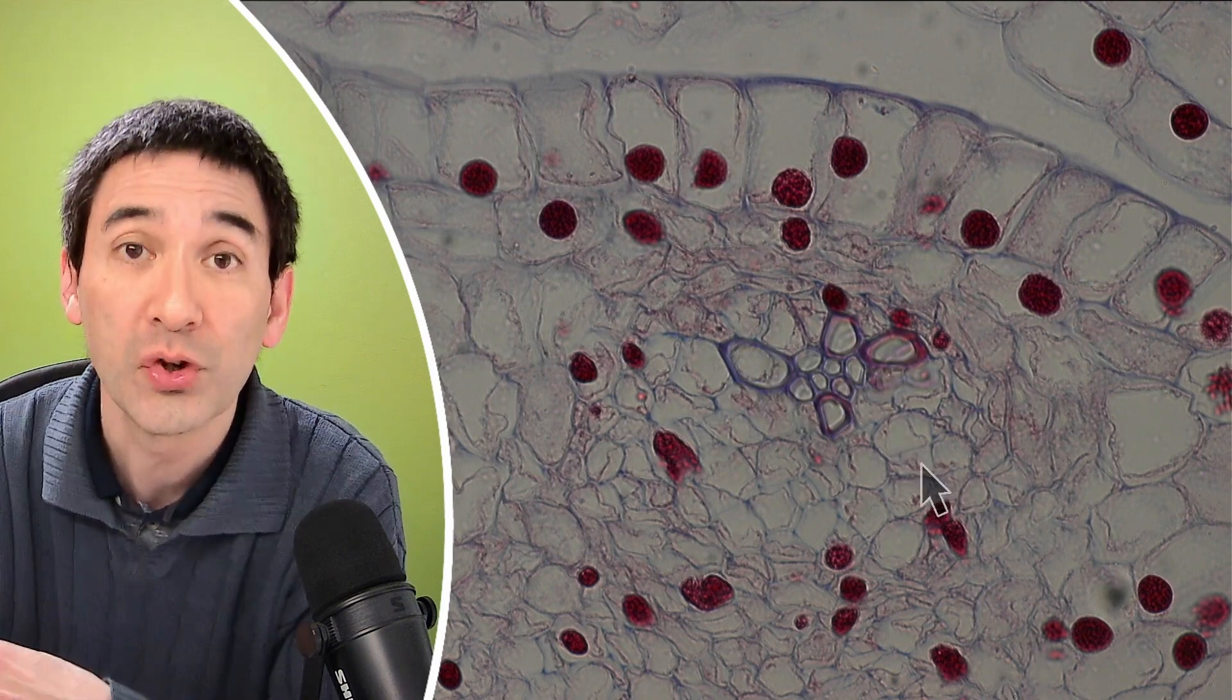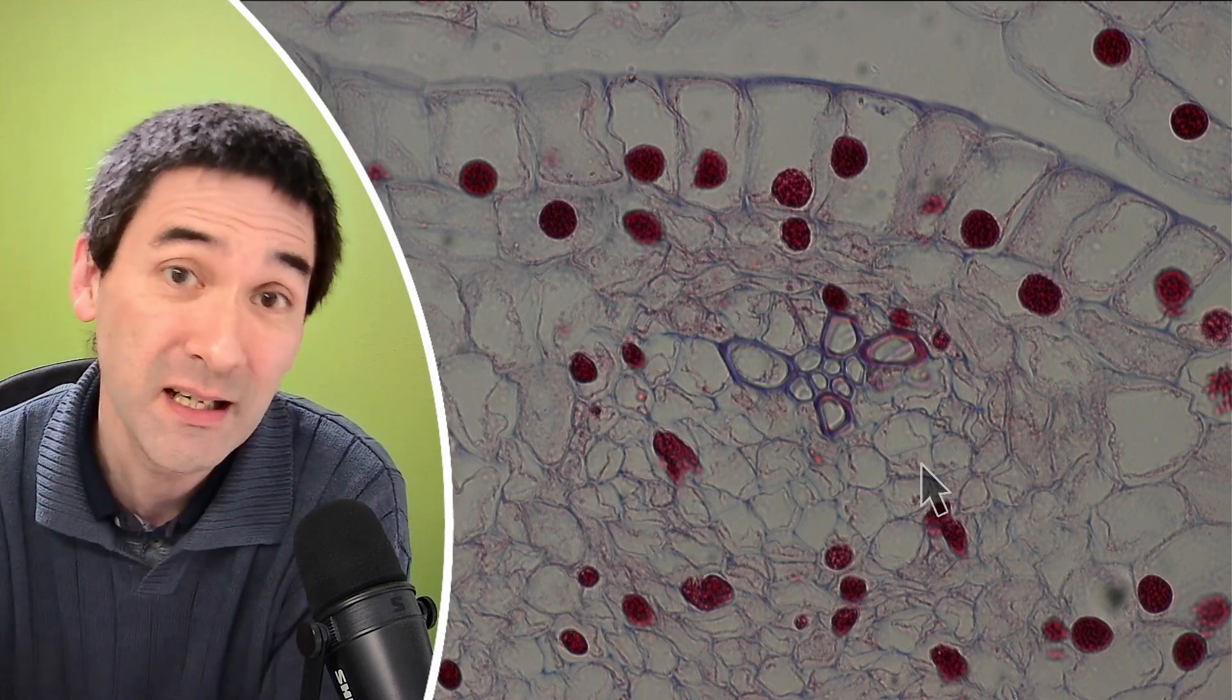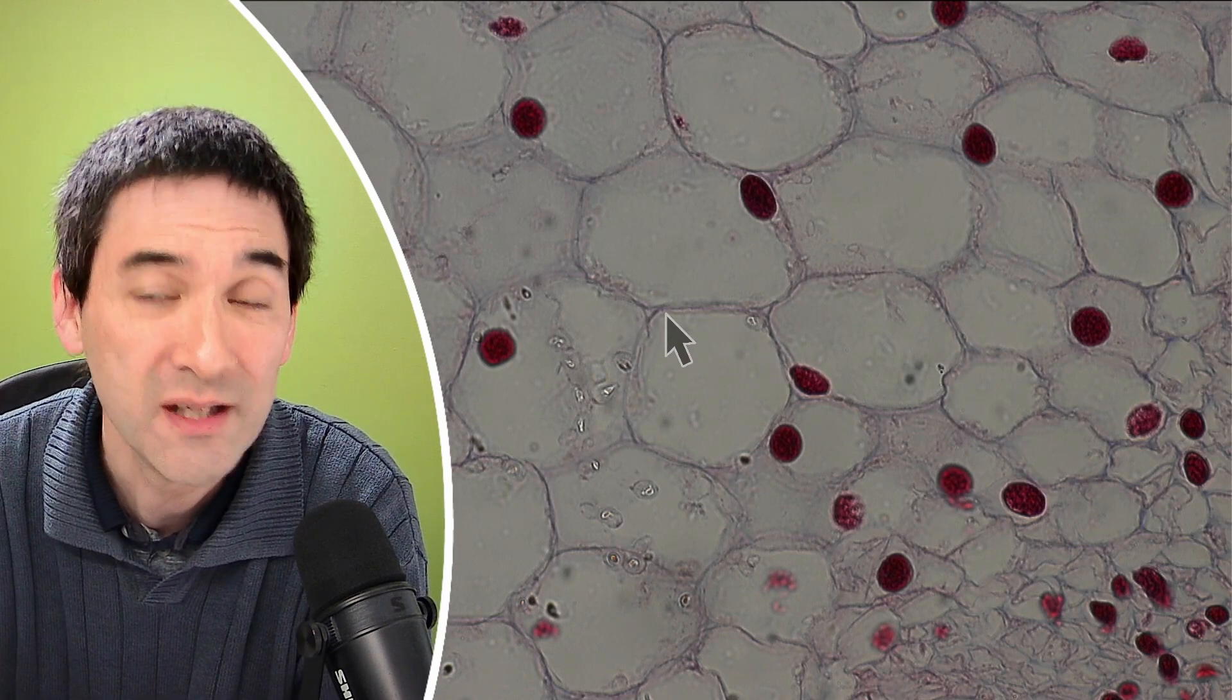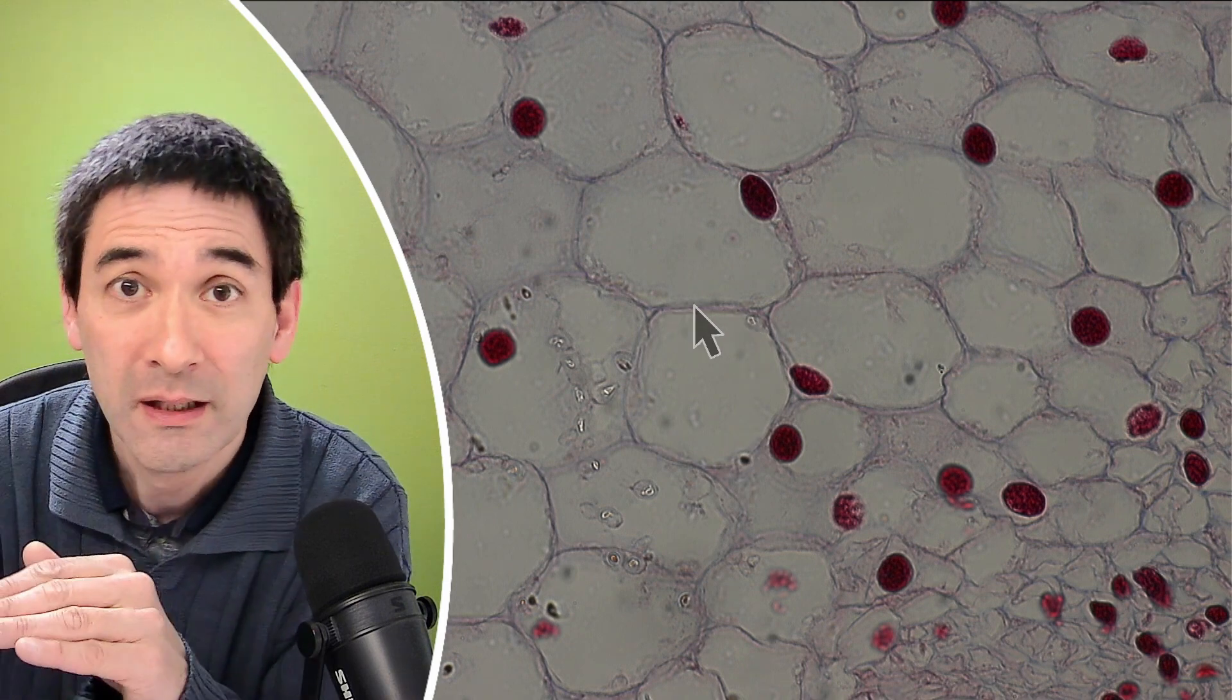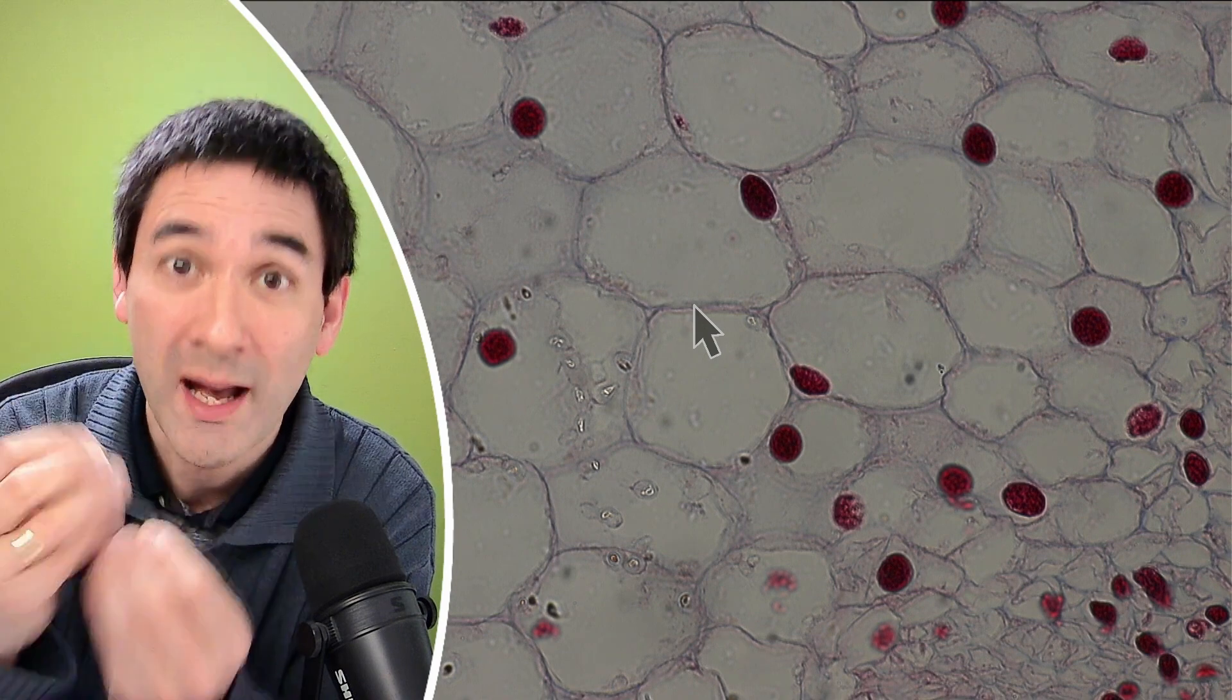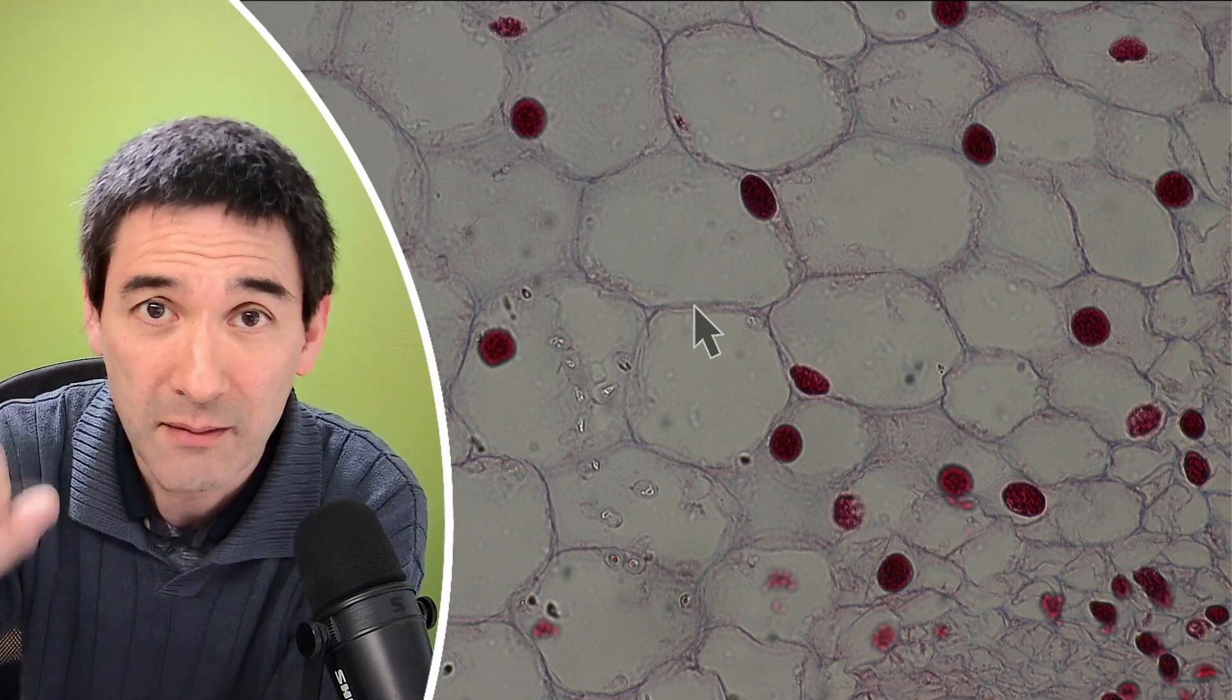So again, here, xylem tissue, thick cell wall. And again, in cross-section, it's why we do not see the long tubes, because, of course, we're just cutting it across. And this basically means that some plant cells actually do not have a nucleus, simply for that reason, because they don't have one. Again, over here, you can see that plenty of cells that also do not seem to have a nucleus, even though they should have one, but actually, because we kind of lost it during the preparation. When you cut open the cell, for example, then, in this case, the cell contents wouldn't flow out, because the plant tissue has been embedded in paraffin, which is a wax. So it's not liquid anymore, but still, you have removed it by actually making a cross-section.